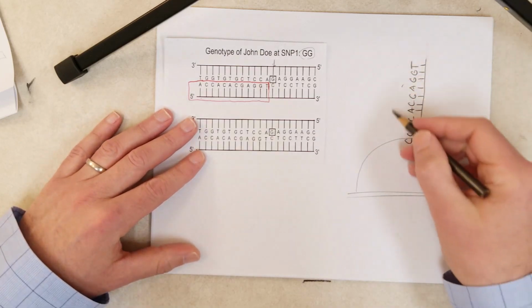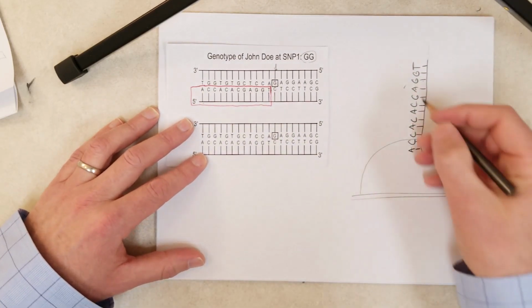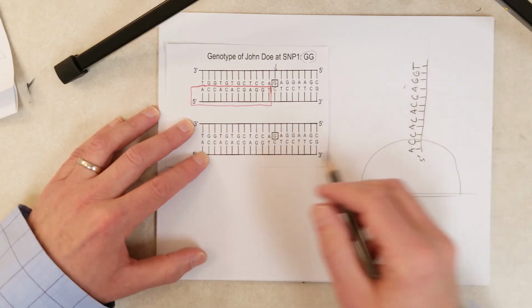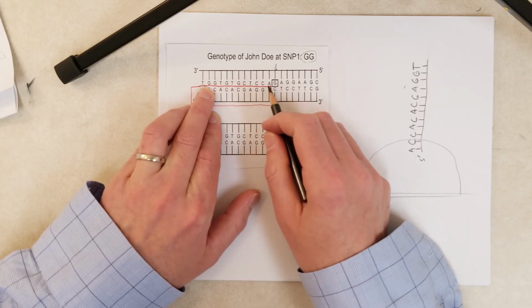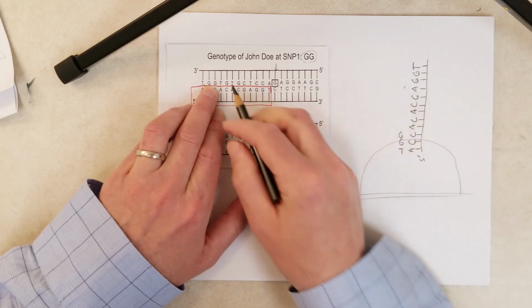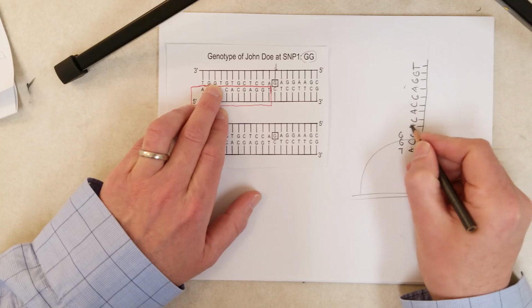Now that DNA is floating around here in a buffer, and those single strands can now anneal to the SDOs. And so we already said John's DNA looks something like this, right? Okay, so we can put TGG. So this little piece of DNA eventually is going to find this, and it's going to anneal to it.